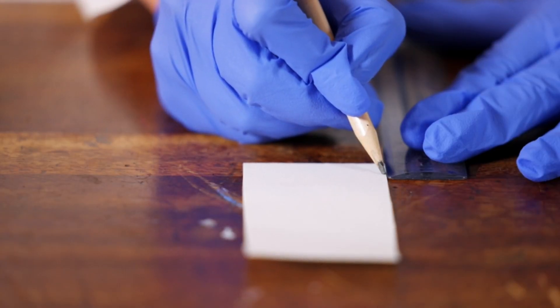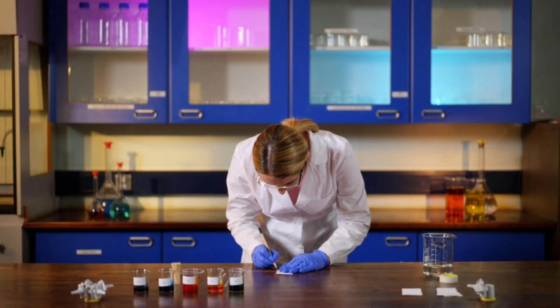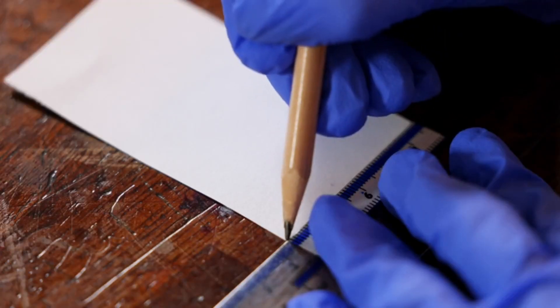Start by putting chromatography paper down on a clean, flat surface. Now use a pencil and ruler to draw a straight line about one centimeter from the bottom of the paper.